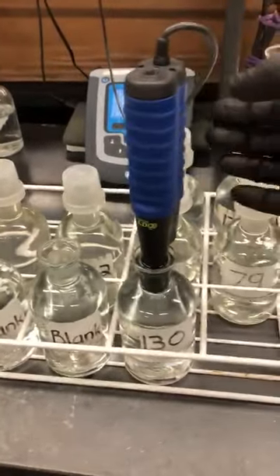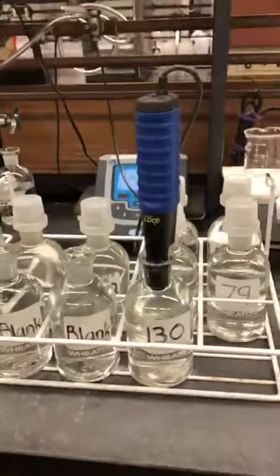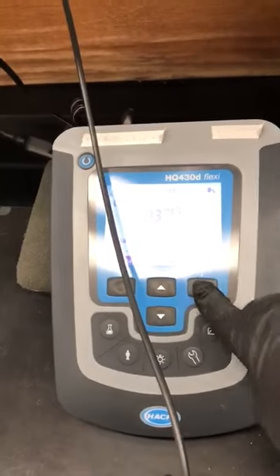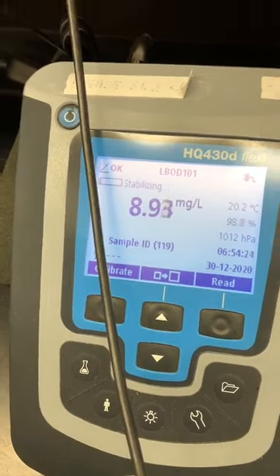Cover it and put it in the bottle. Move the button over here and save. Waiting for the next number, continuing through the remaining samples.